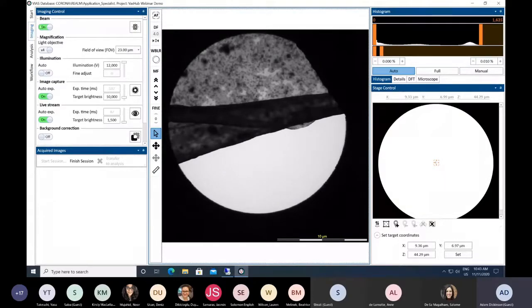I'll go through why this may have happened, how we can avoid this. And what I'd like to just take you through is how we actually control the microscope itself. So one of the steps that we've skipped this morning is that we've actually turned the electron beam on. Now, typically we allow this beam to stabilize for around 10 to 15 minutes. And then we go through a process of optimization in terms of centering the beam to make sure that the beam is on axis and transmitting through the sample perfectly straight. We also make sure that it's free of any astigmatisms, and what that is essentially correcting for any differences between the electromagnetic lenses that actually are present in the MiniTEM.